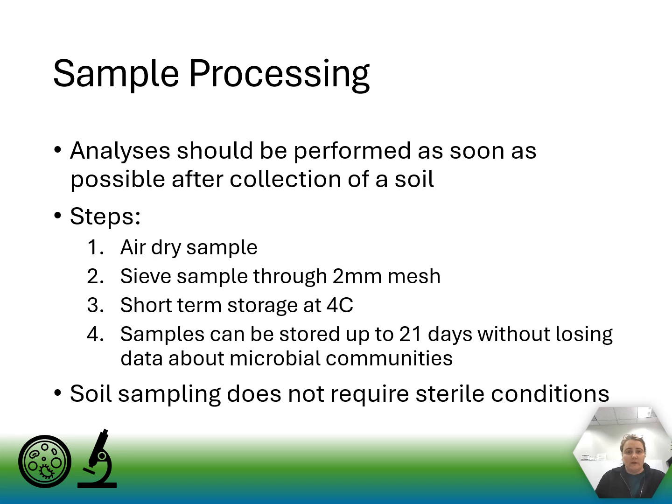Once we have the soil, then we need to think about performing those analyses as soon as possible. One of the challenges with a soil sample is the moisture content related with the soil. And moisture content is huge when it comes to soil. If you've changed it a little bit, you've changed the microbial community completely. So moisture is kind of a big thing when we think about soil sample processing.